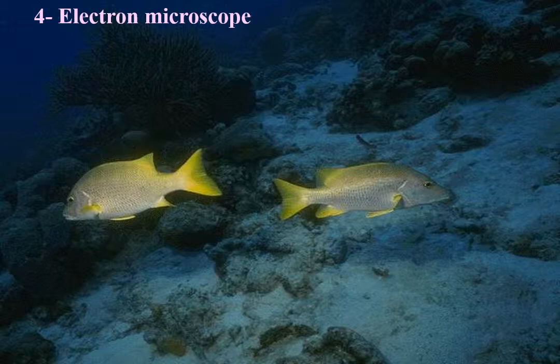Electron microscope gives a very high magnification and resolution power. It is used to study the minute details of cells. The source of illumination of this microscope is a beam of electrons. There are two types of electron microscope: transmission electron microscope and scanning electron microscope.